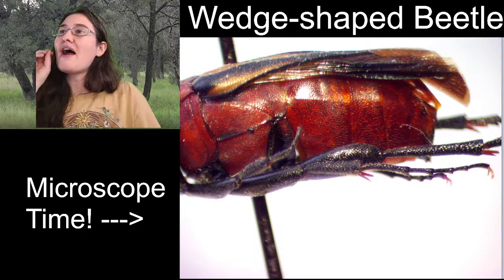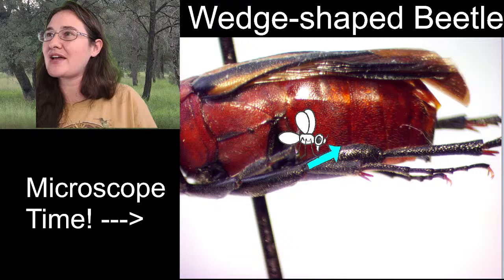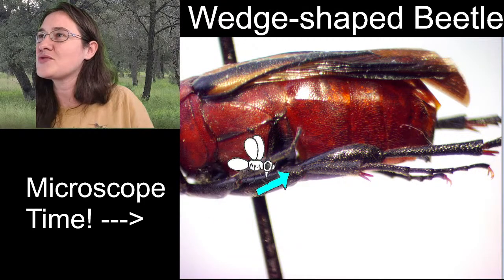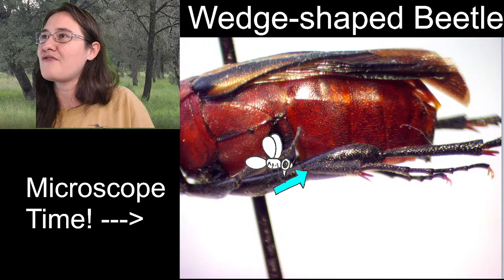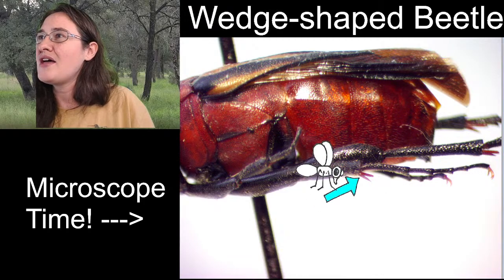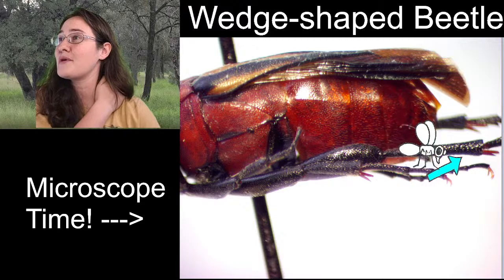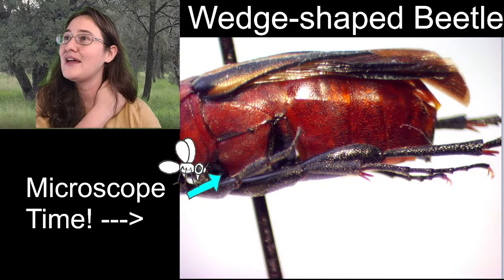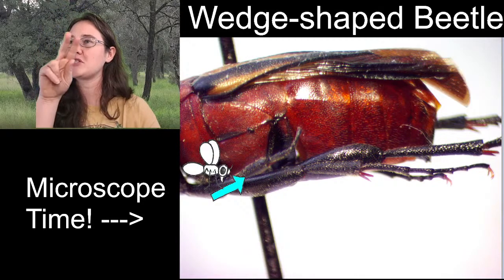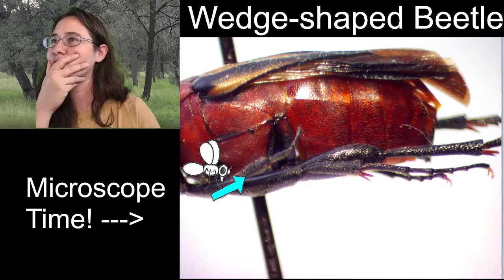All right, I'm going to go ahead and walk you through this because the legs are almost intermingled with one another. This right here is the femur of the middle leg. Then you have your tibia. These little two guys here, those are your tibial spines. There are two on the middle leg and two on the hind leg. We're going to have to relook at that front leg. It's possible that the spines are almost mobile and they open and close. So we'll see about that.